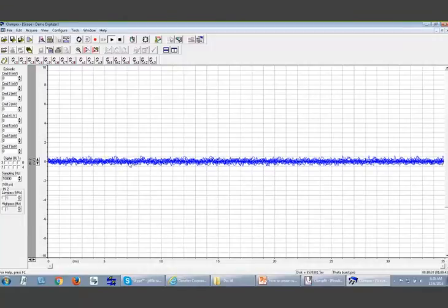Yep, you see that? Right. This is another train, second train. Now you wait for another one because, like I said, this one I'm not connecting to the stimulator, so you won't see those stimulation artifacts. But by doing this, you can see here another 20 seconds. Now you can see another 10 epochs is coming up from here.